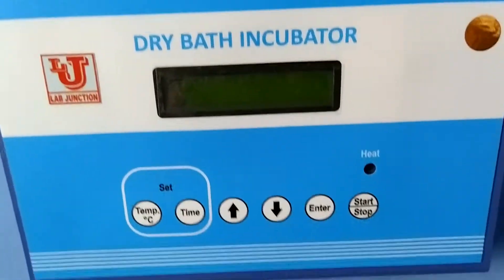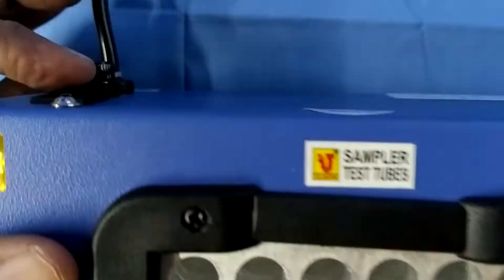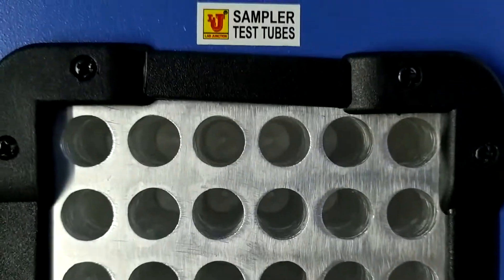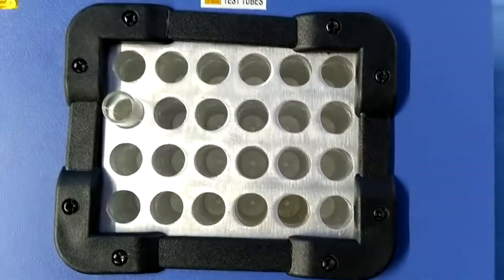Now, how can you use this Dry Bath Incubator? Switch on the instrument. These are the racks for placing test tubes.